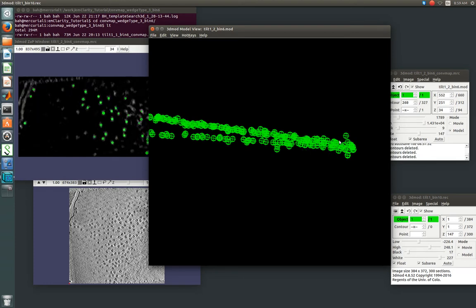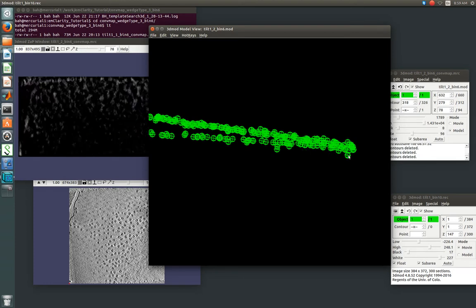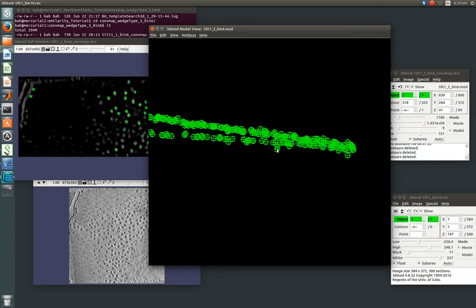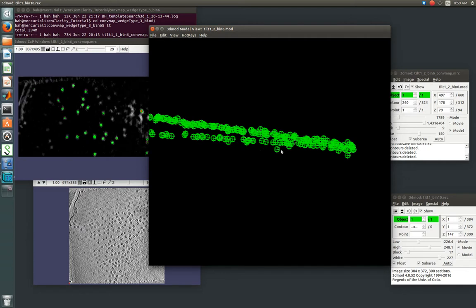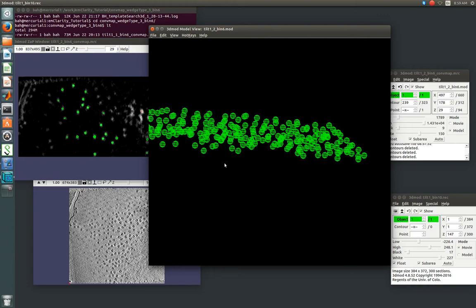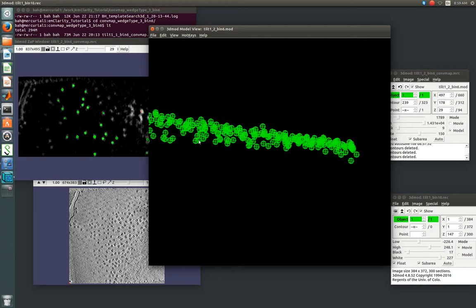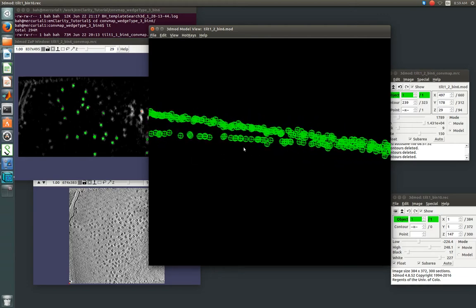Because the junk happens to let it into play, and this is pretty easy. Now, this guy, you want to confirm, it does look like it's still junk, so I'm going to get rid of it. But for the finer editing, I'll probably go back to the other window to do that.